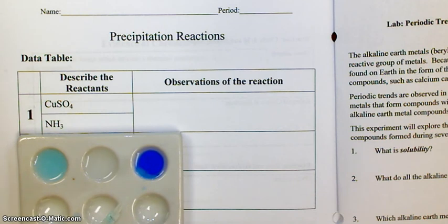You can see that kind of milky blue. That's a precipitate. So not only do you get a color change, but you also get a precipitate. Okay, so in your observations section, you should have 2 pieces of evidence that a chemical reaction occurred. Number 1, it changed to a nice deep blue, and number 2, you had a light blue precipitate.